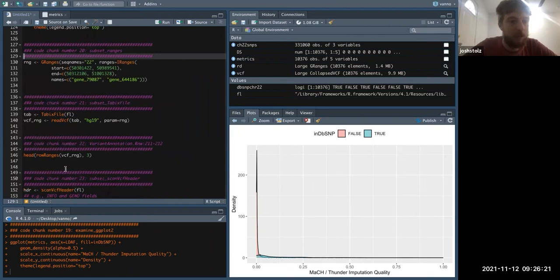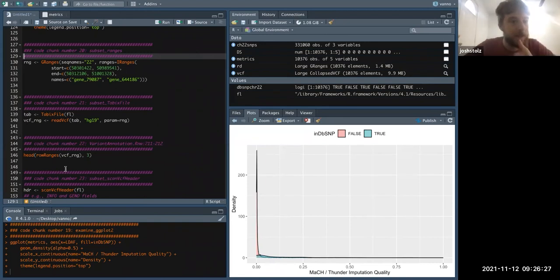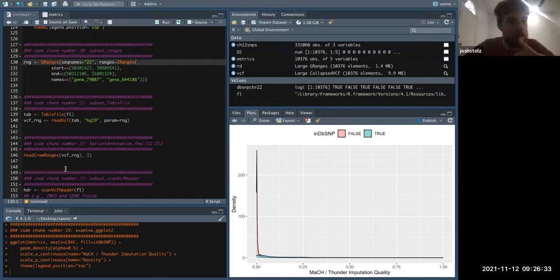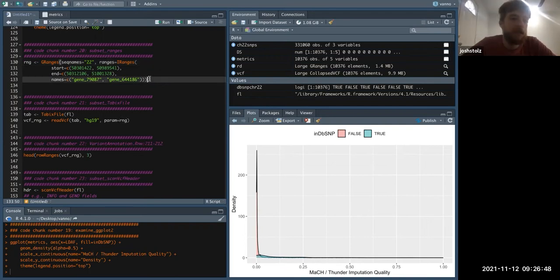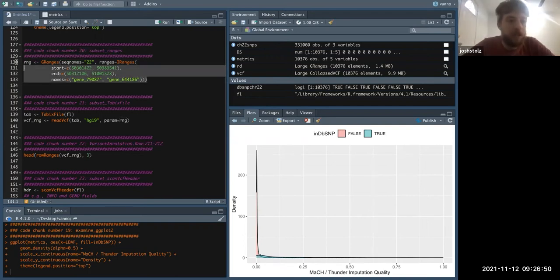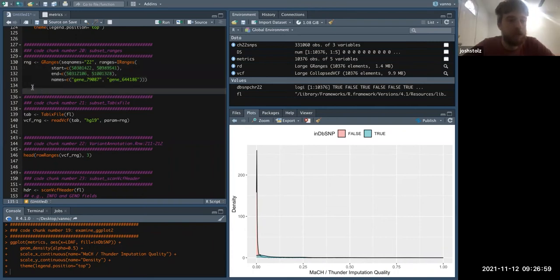The next section talks about how we can use GRanges and IRanges to subset by region or even by feature name. Making this object can actually be used to read in the VCF — so if this is all we wanted to look at, we could actually read in the LIBR data for a specific region. If there are specific regions people wanted to look at, that would be a functional solution to our data crunch problem.